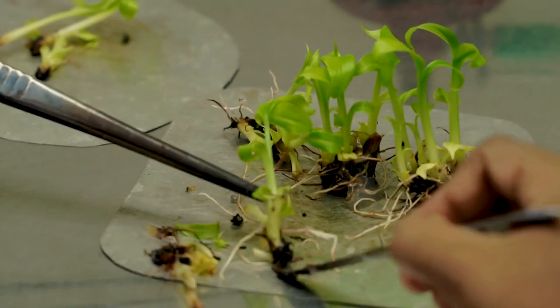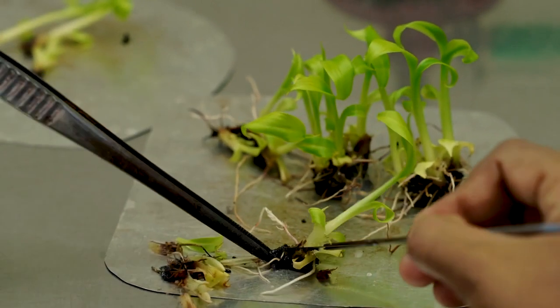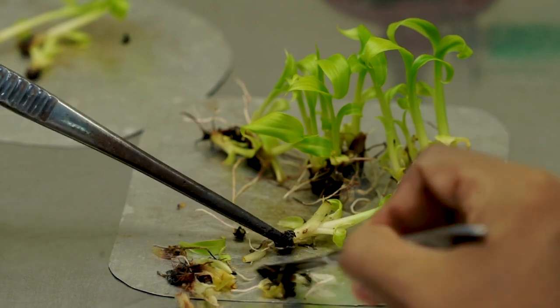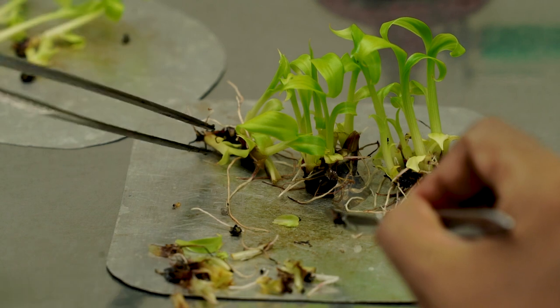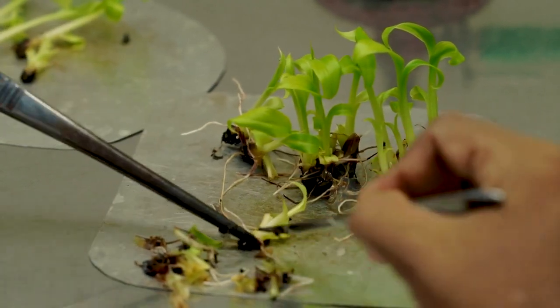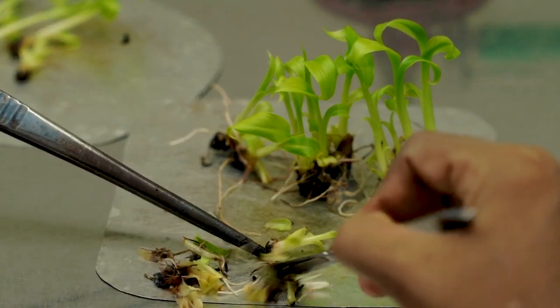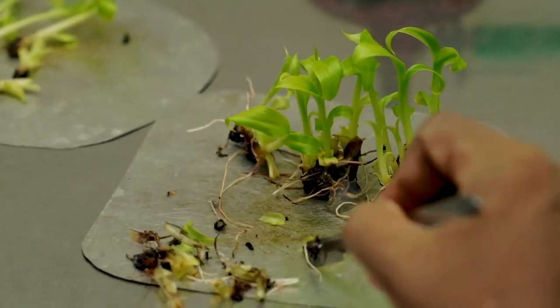Now you can see, for further multiplication of the shoots, these are removed from the culture jars. These are cleaned, the blackish and dead tissues are removed from the shoot, and these are further trimmed into smaller size and transferred again into fresh media. This is the process of subculture.